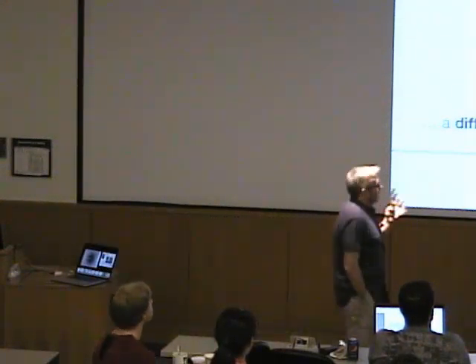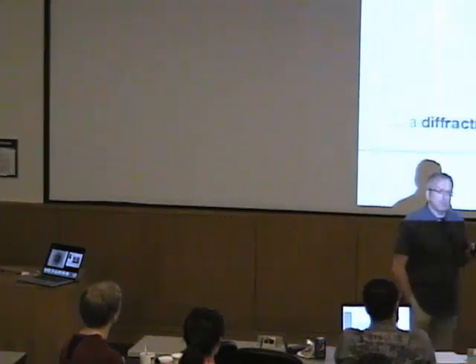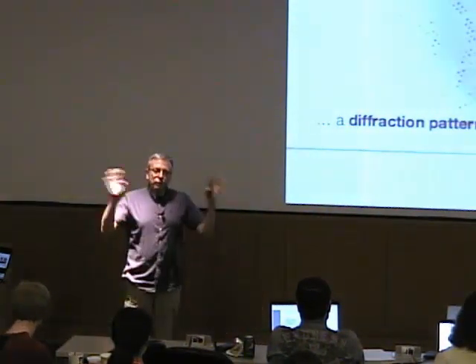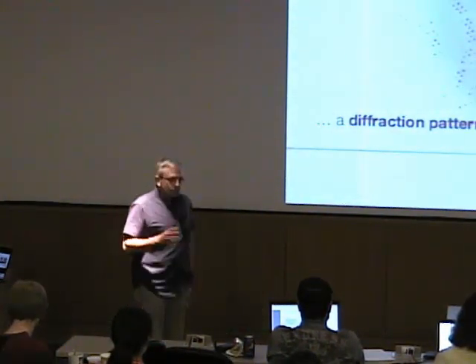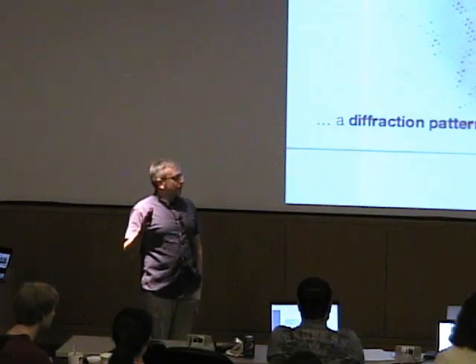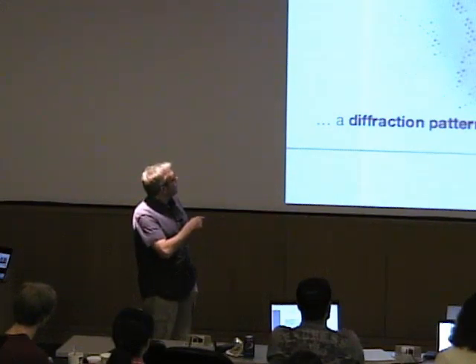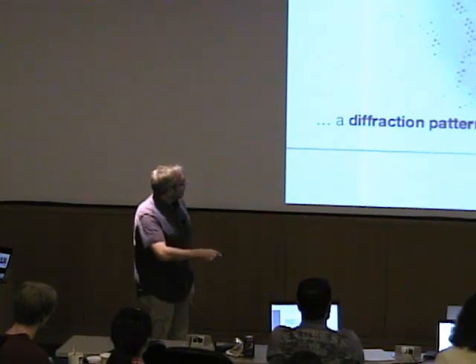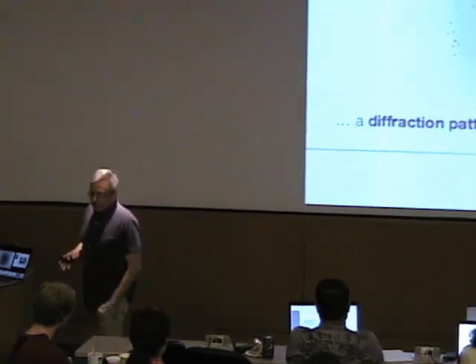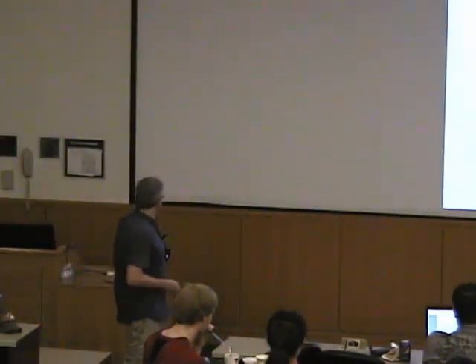So crystallography is a rather broad topic. And actually, Amy gave a lecture on this 2 years ago. Her slides are in the folder, and I think that lecture was way broader than what I'm going to talk about. So I'll pick a bit of a topic, and I leave some others out, maybe giving me the chance to be invited again to fill in some of the gaps. But in the end, really today, I would like to focus on what this is and what's actually happening here. So I would mainly talk about the idea of this diffraction image and what to do with it and what to learn from it.